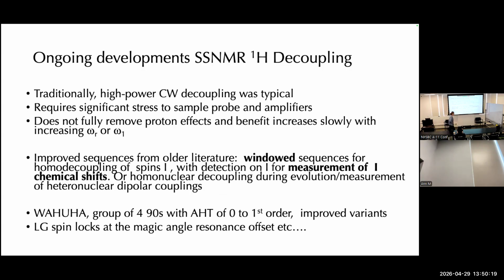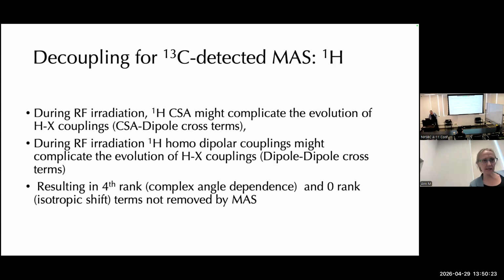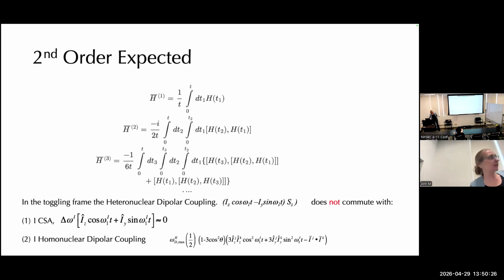How big are the cross terms? In general, when you do that Magnus expansion, let me just go back to that slide for a second, for each new term you are going to entertain the product of two couplings. But then you integrate over one cycle, and that has the effect of saying, multiply these two couplings and then divide by the RF term.